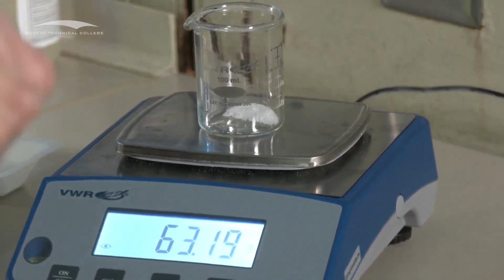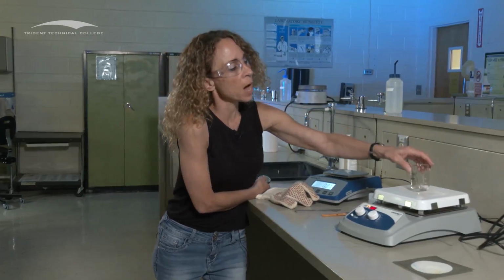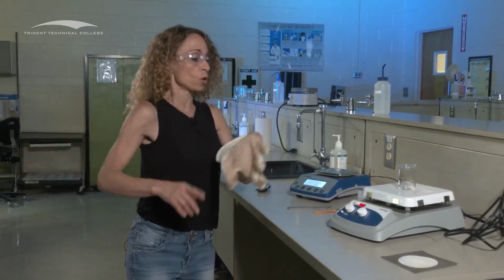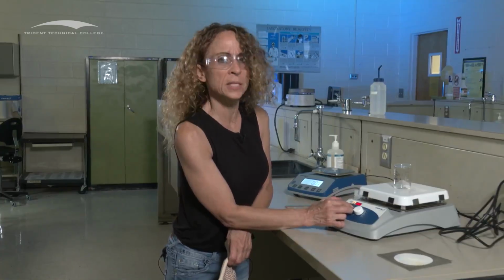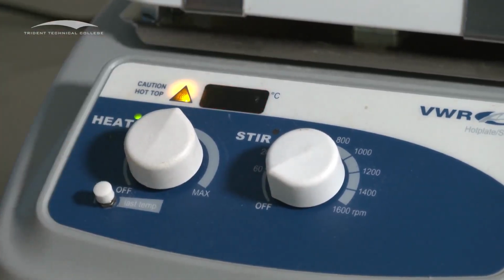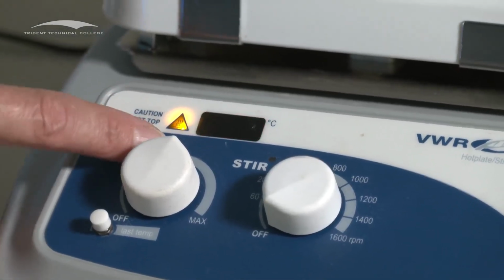Now you're going to do this again. Put it back onto the hot plate for the specified time, which I believe is 5 minutes for the second cycle. After 5 minutes or the allotted time, you're going to do what? Now also note this, you need to crank up the temperature at this point, okay? We're going to crank it up to 250. So crank up that temperature first. Let it adjust, okay, 250, 260. It doesn't have to be perfect for this part. Okay, then when this stops flashing, your temperature is ready to go. For the sake of time, I'm pretending we're there.